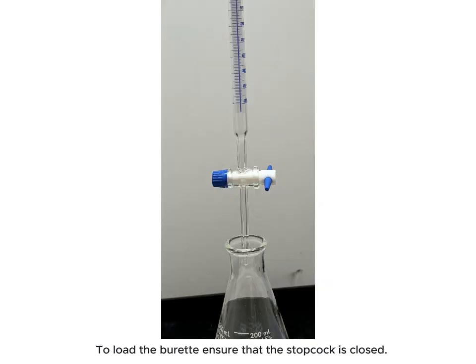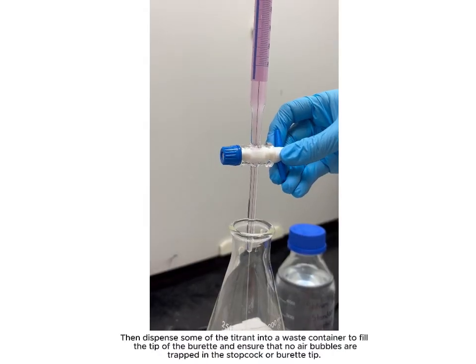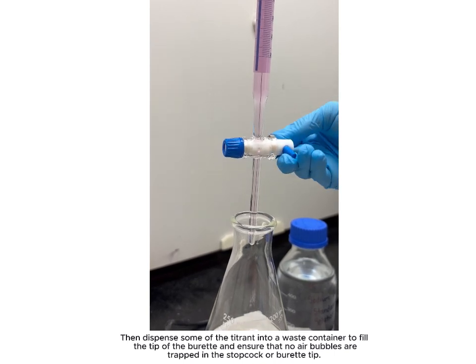To load the burette, ensure the stopcock is closed. Add the titrant using a funnel. Then dispense some of the titrant into a waste container to fill the tip of the burette and ensure that no air bubbles are trapped in the stopcock or burette tip.